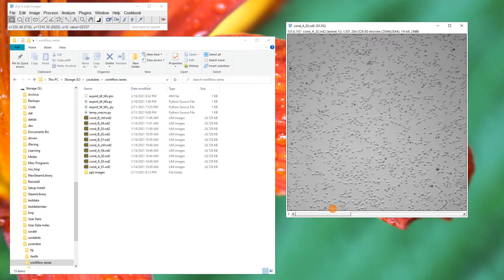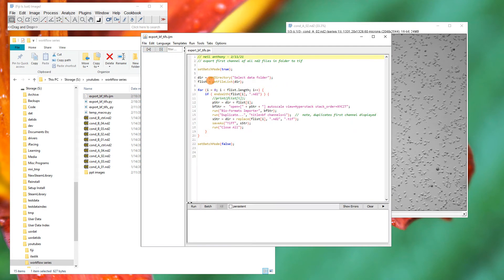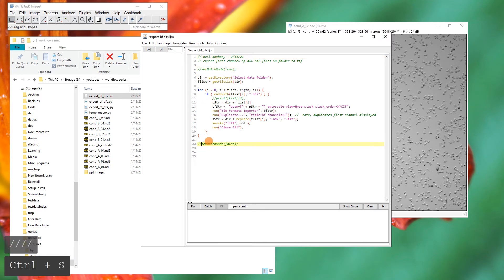We're going to use a macro to export to TIFF, taking just the brightfield channel. I've already made the macro, and we're going to do an aside shortly after this to go into how the macro was written and the workflow of how you would put a macro together from scratch. In this one, we're just going to drag and drop and have a quick look to see how it's made.